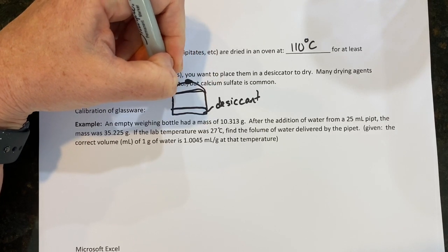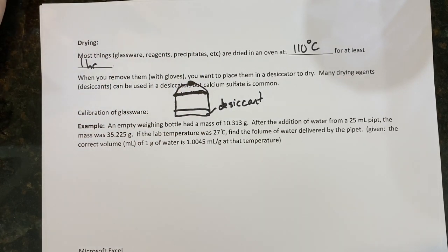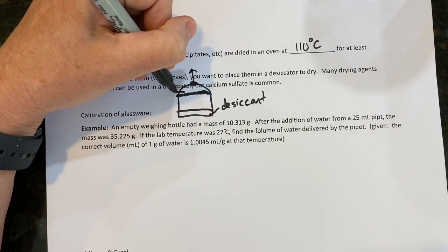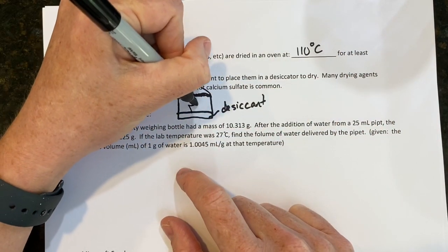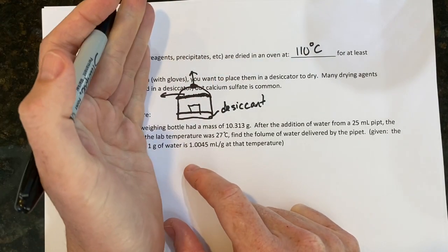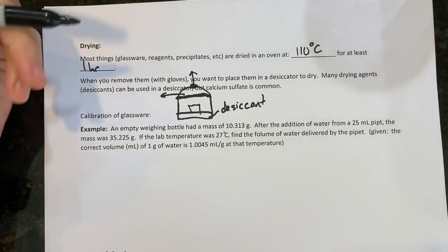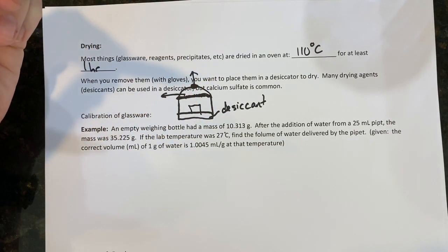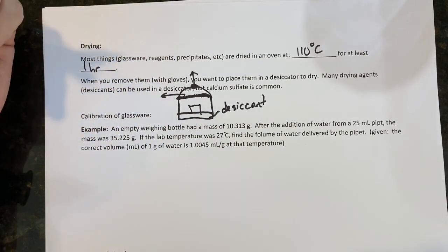And then they even have an oil that they put all around here to make sure it seals really, really well. And this is where almost every single person who's new to a lab struggles, because they all try to pull up on the lid, and you want to make sure you actually slide the lid off. You're going to slide the lid off, put your hot sample inside, and then slide the lid back on. And that will allow your sample to dry and not soak up additional water. Then you can take it directly over to an analytical balance where you can mass it and find out exactly how much is there based on the original mass of the crucible.